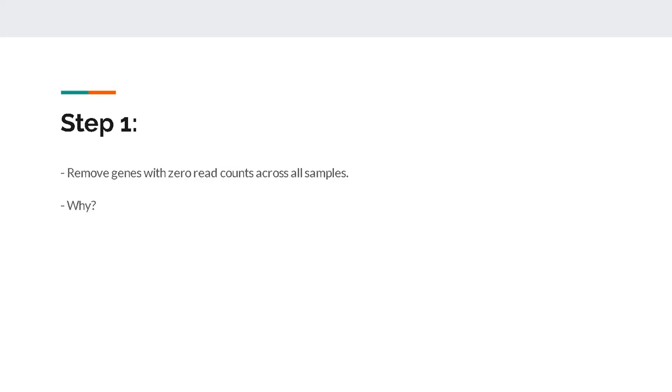So you might want to drop those genes. Statistically speaking, these genes which have all the zero read counts will lead to a larger value of n. That can reduce your mean from the actual mean that you could have gotten with just the genes which would have really been expressed in all these samples. So for that reason, we need to remove these genes with zero read counts, and we'll come to other specific reasons why we did this when I explain in the next slides.